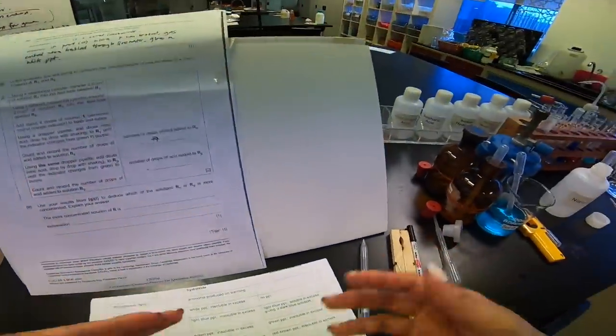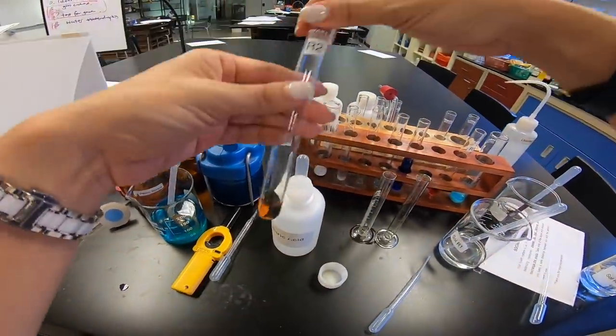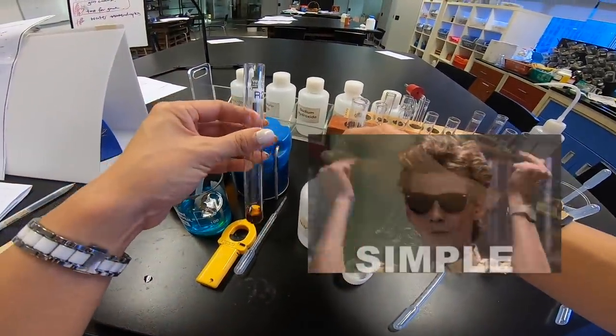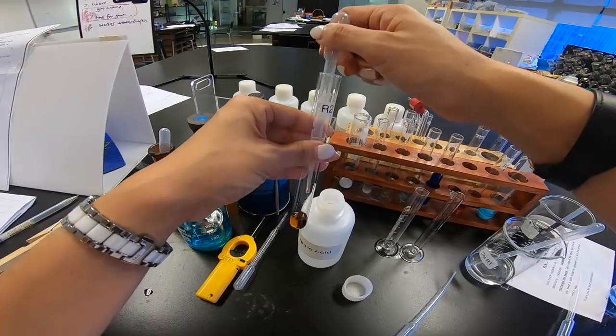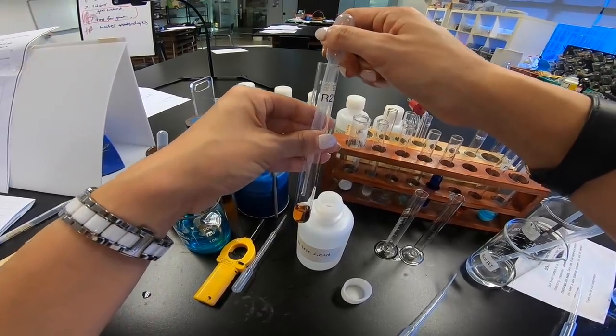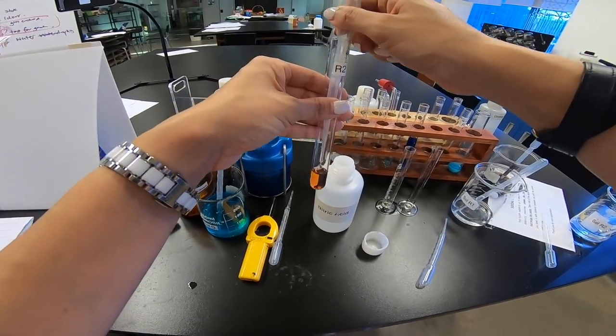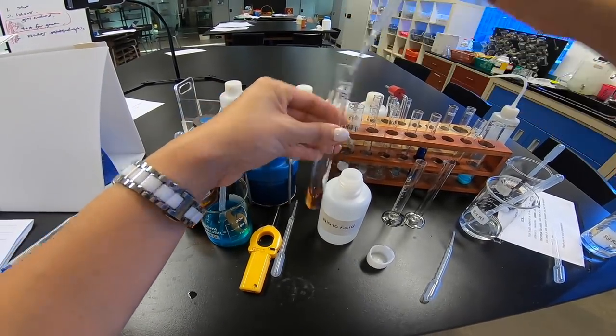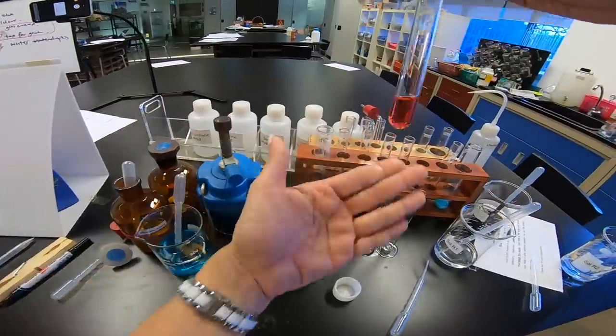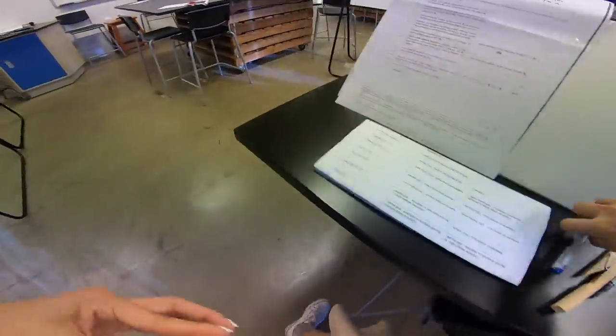Well, we're going to repeat for R2. This is quite a good experiment. Easy, peasy. You just need to count the number of droplets. Quite fun, right? Okay, let's go. 1, 2, 3, 4, 5, 6, 7, 8, 9, 10, 11, 12, 13, 14, 15, 16, 17, 18, 19, 20, 21, 22. Whoa! 22, it changed! Okay! So, I'm going to write down 22.